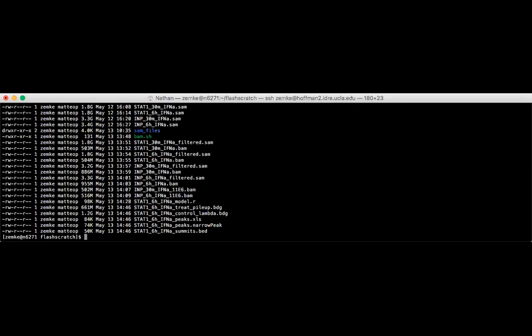Also, there's not a lot of STAT1 binding sites on the genome. I think that is true biologically. It's mostly just activating genes involved in protecting the cells from infection.